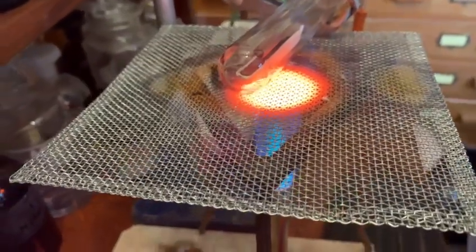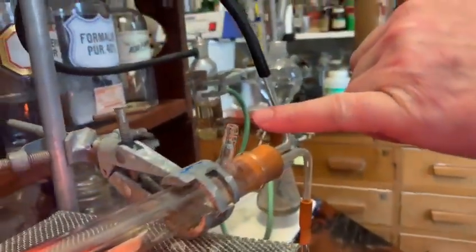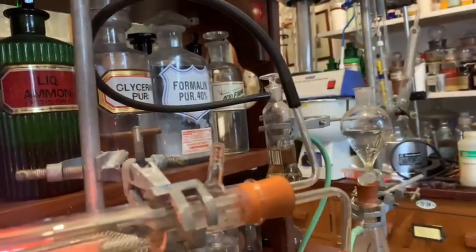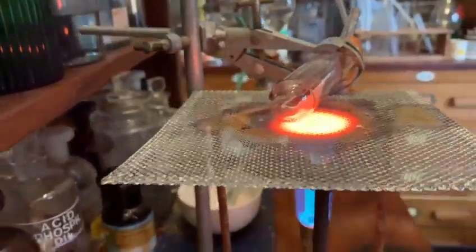I'm going to prove that to you now if I just remove it. You can see some steam coming out here of the combustion tube, just here, showing that the copper oxide is giving up its oxygen, combining with the hydrogen to produce water, and leaving behind pure elemental copper.